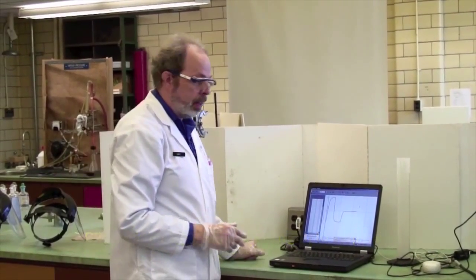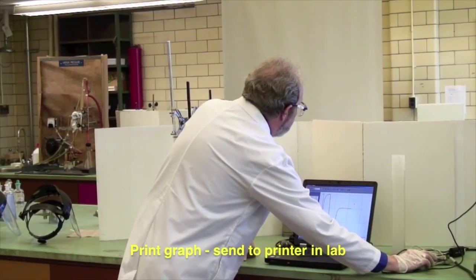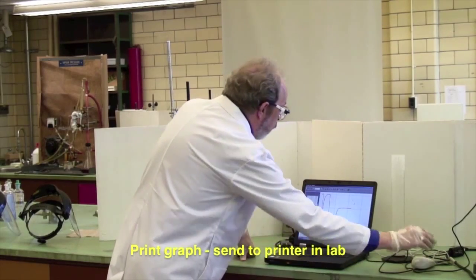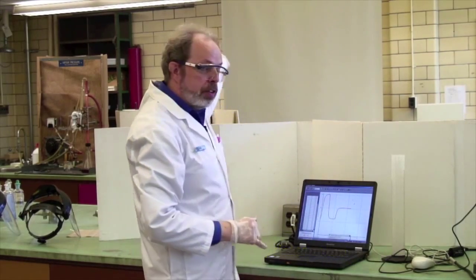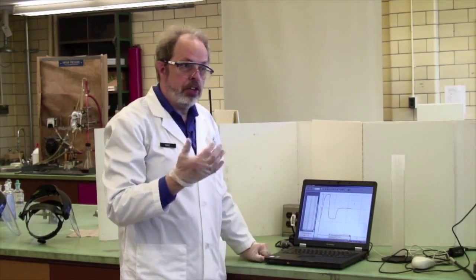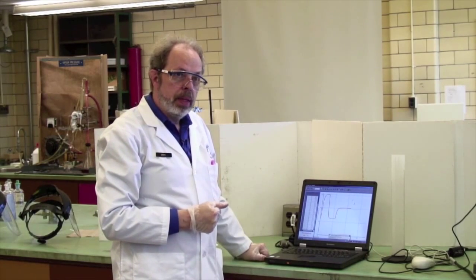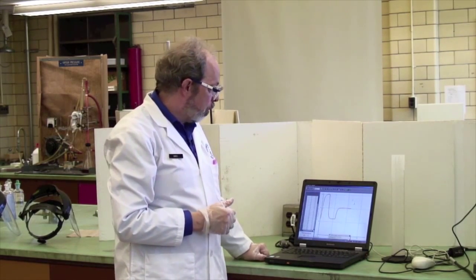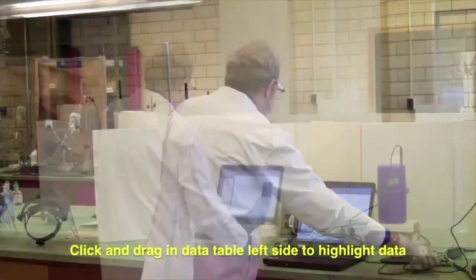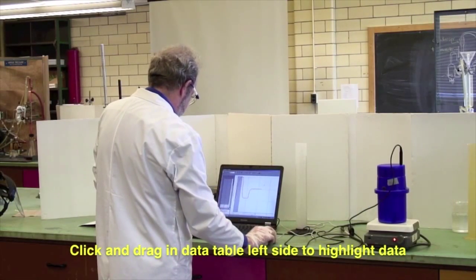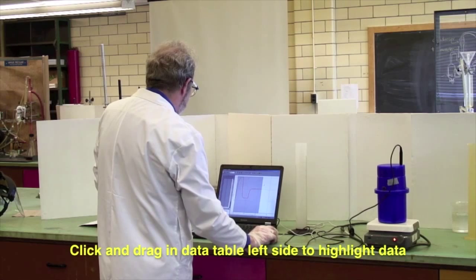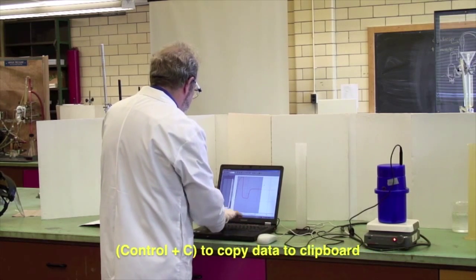And you can print this by finding the print icon over here. And the printer is over at the other side of the lab. And you can get a hard copy of this. The other thing you will probably want is to collect the data. And collect all the data. There we go. And copy. Control-C.